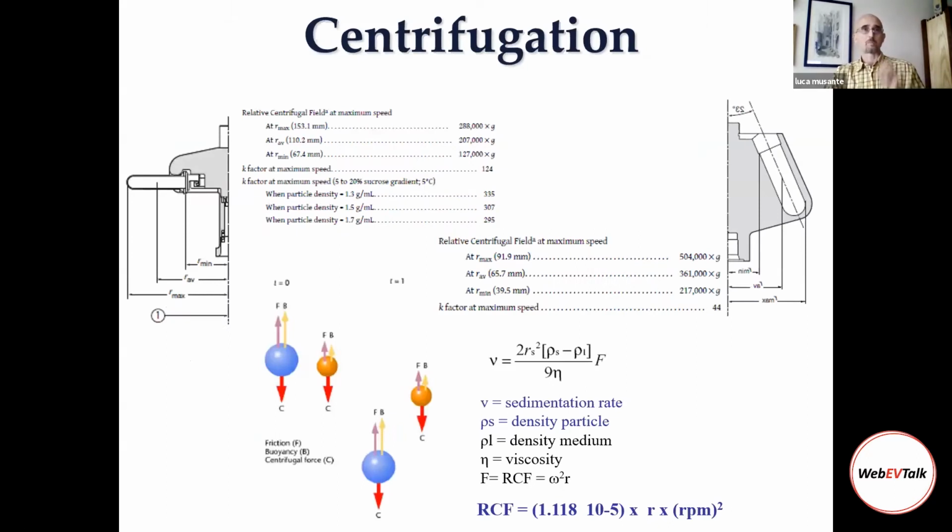In this slide, we want to sum up the principle of centrifugation. Of course, we can have different types of rotors, different geometry, different volumes, and different sizes. Even if we don't have the right rotor, and we read in some paper that the study was carried out with a different one, there is a way to convert the parameters in such a way as to get the same yield in the final pellet. This is provided that all the details are written, or you provide all the details. This is why it's so important to be clear and transparent during reporting. It could sound trivial and a bit naive, but in a comparative analysis, the first thing that I usually think of is to run the samples at the same volume in such a way that the length of the sedimentation path is the same for all the samples.